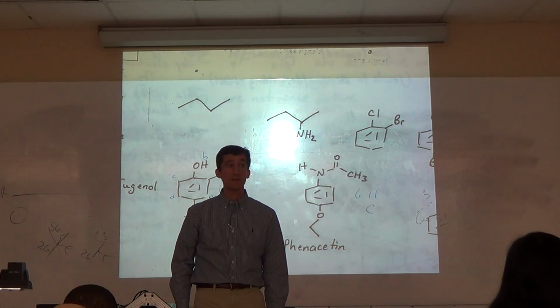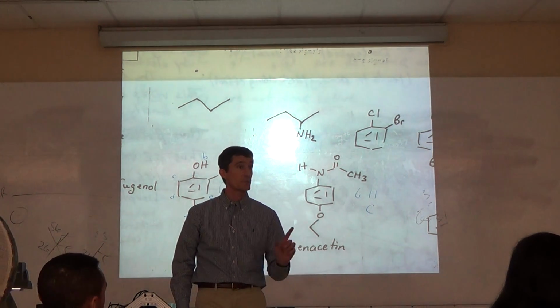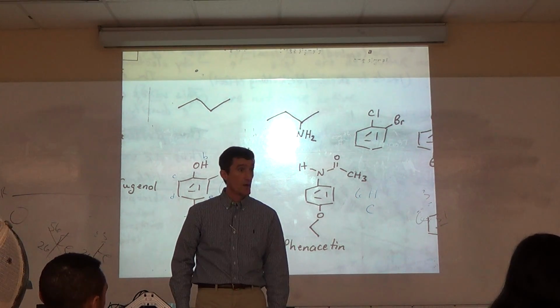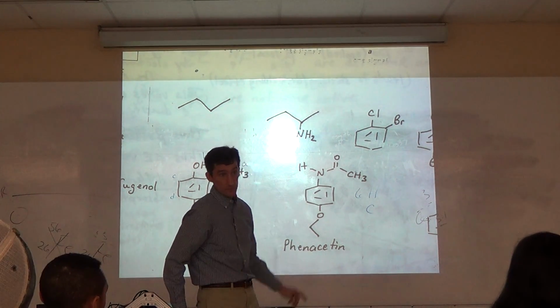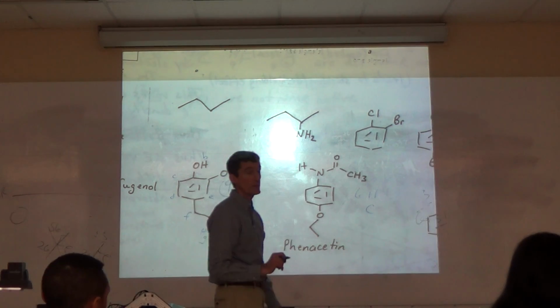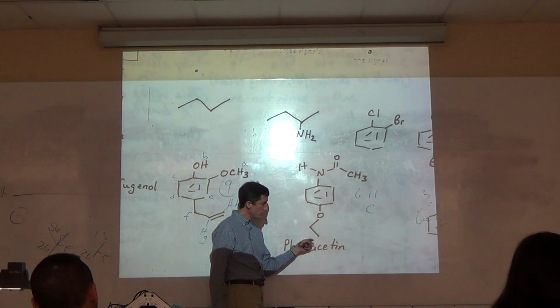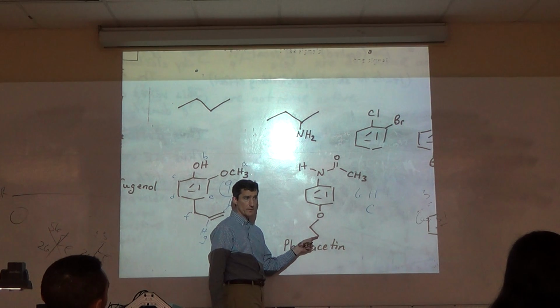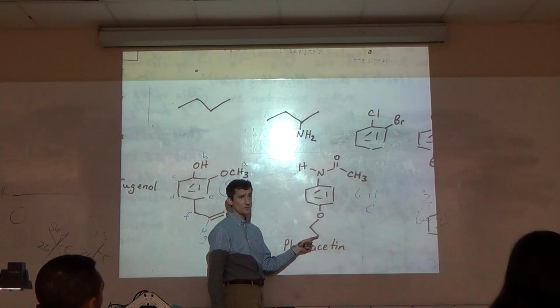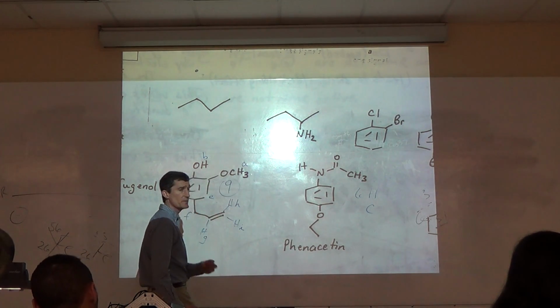I told you this on the first day. About 1%. 1% of the carbons in that molecule are going to be C13. That's what we'll actually do carbon NMR on. Not every molecule will have this carbon be C13, but because there are gazillions of molecules in your tube, some of them will be C13 and you'll get a signal for them. In the end, we can get a signal for all the carbons, but it's coming from the C13.